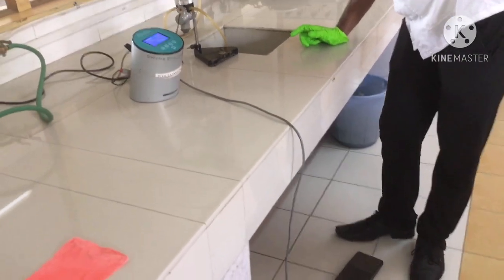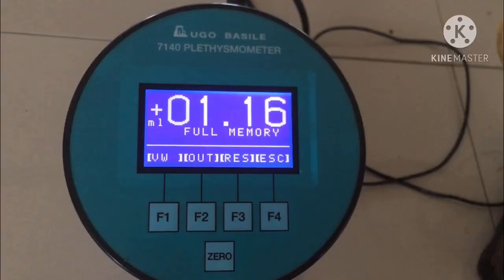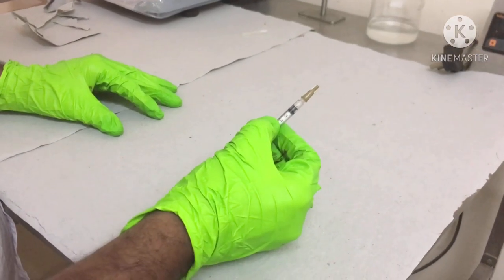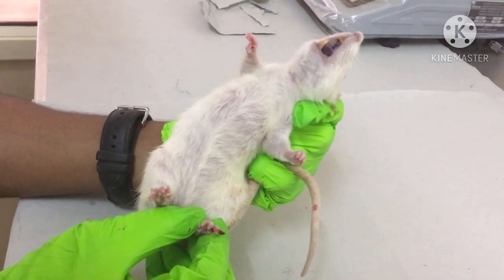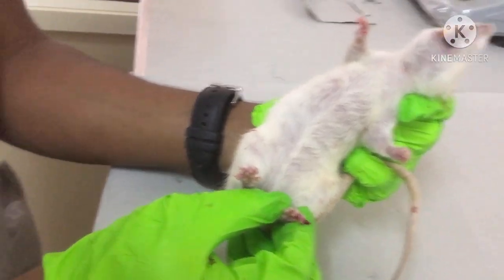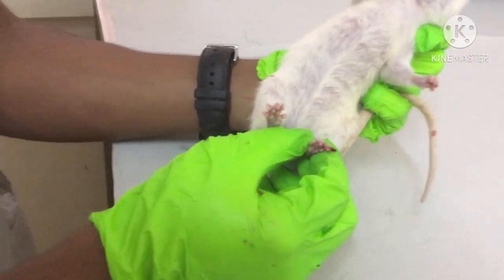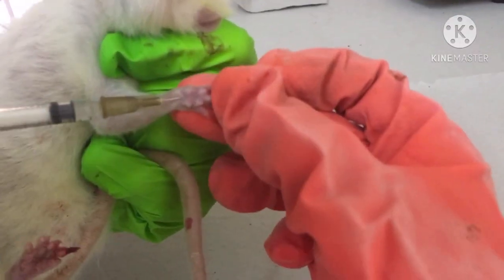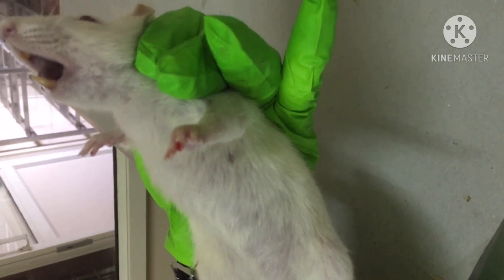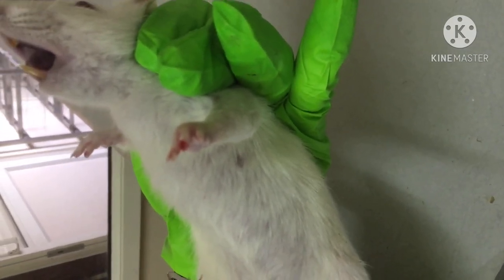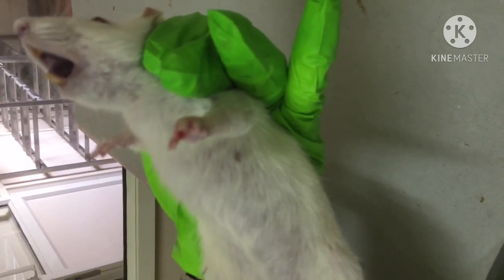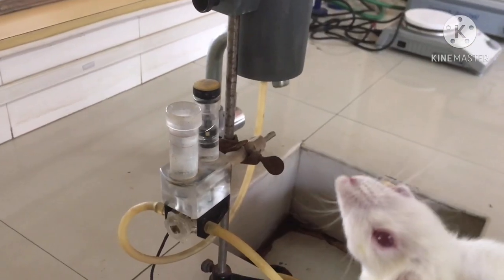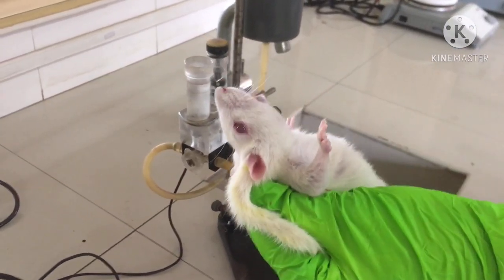Now we are giving 0.5 ml of carrageenan according to the weight of the animal by the subplantar route. You can see this is inflammation caused by the carrageenan given 3.5 hours before. So now we are going to take the readings of this inflammation — the reading of edema after giving carrageenan.